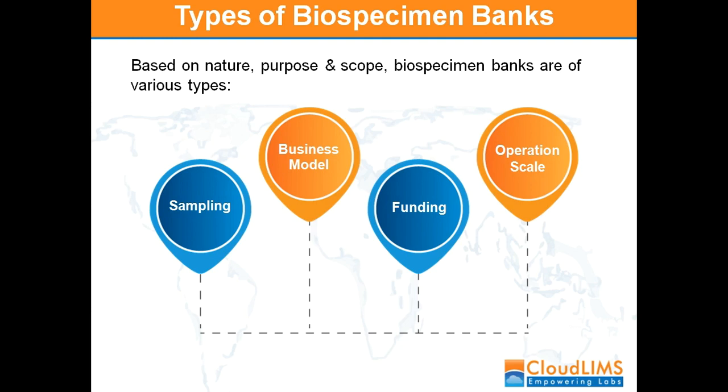The best example of a commercial biobank is the stem cell biobank, where donors store their stem cells for their future use, and for this, they pay the biobank. Non-commercial biobanks are where biosamples are stored without any charge to the patient, and those samples are provided for research purposes. Based upon the funding, whether the biobank is publicly funded or privately funded. And operation scale, whether samples are stored in single laboratories, or biosamples are stored from the whole hospital at one place, or a number of biobanks are interconnected, making a network to store their samples at one place, whether it is national biobanks or regional biobanks.